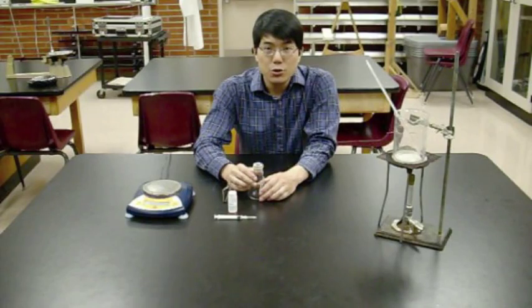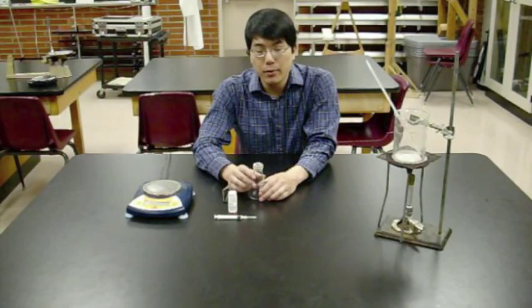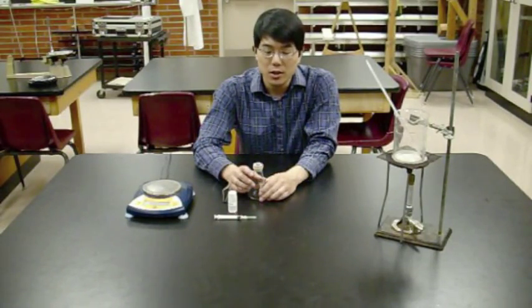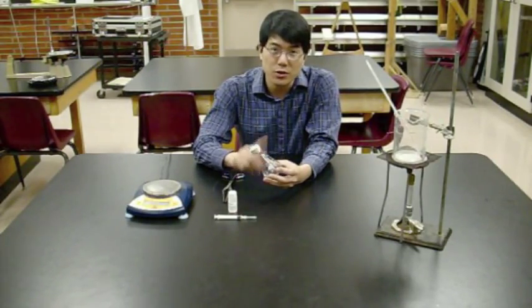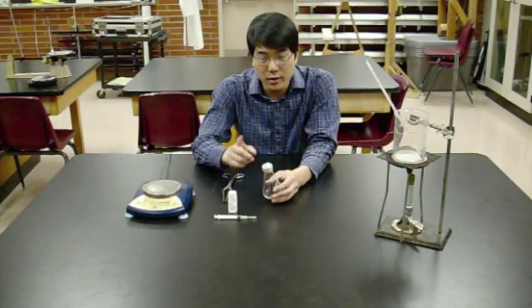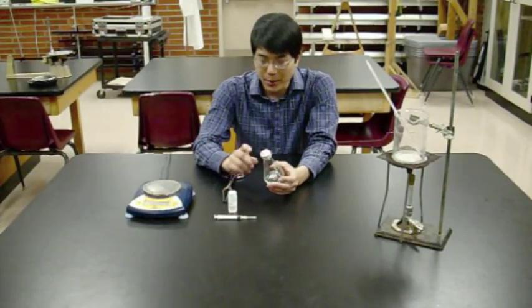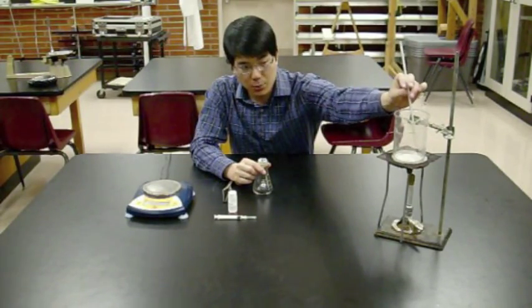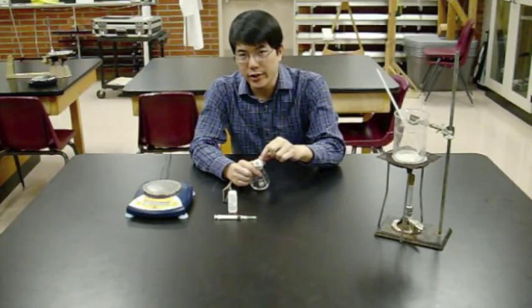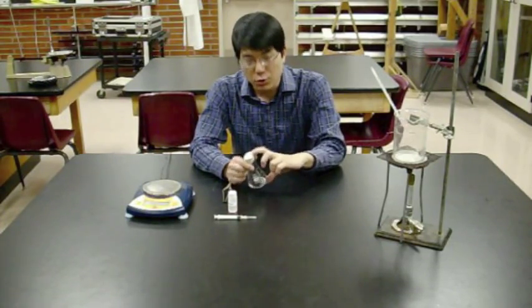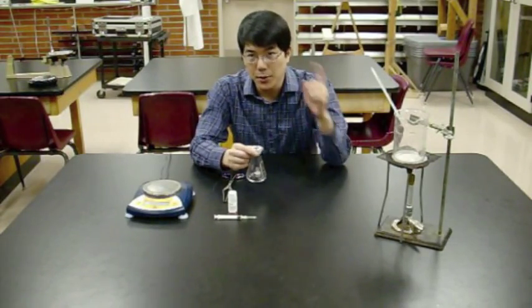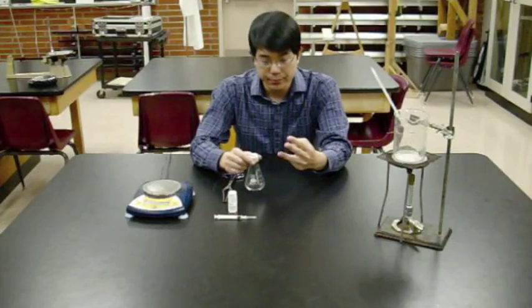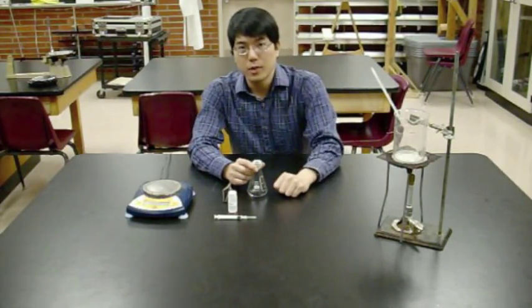That's the end of part one. Part two measures the density of tap water, and part three measures the maximum mass of water this container can hold. The goal of part one was to get the mass and temperature of the vapor, which should equal the water bath temperature. Since you created a pinhole, the vapor pressure inside equals air pressure. So you know pressure, temperature, and mass. Now you need volume—that's parts two and three.